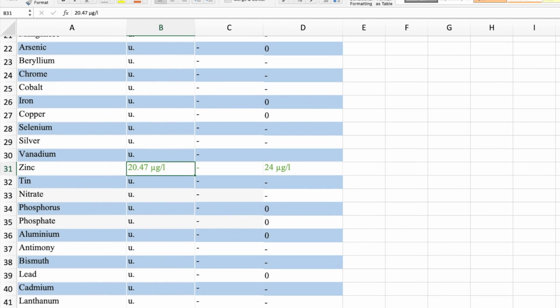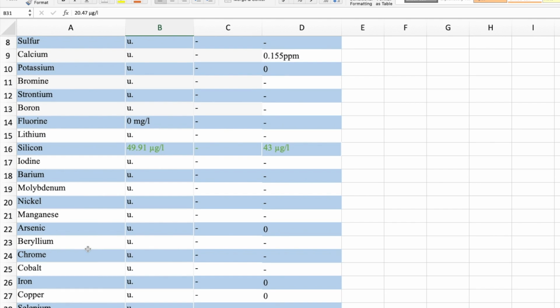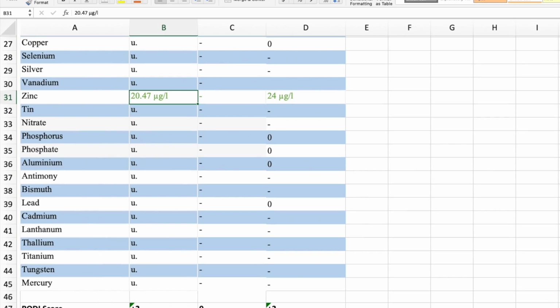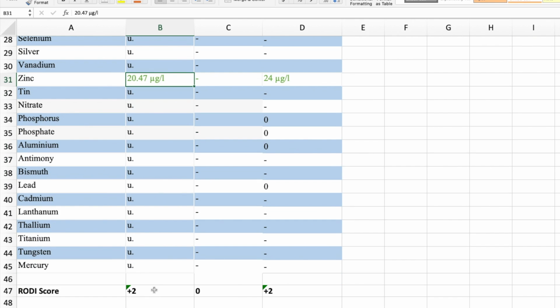For that reason alone, I've given them both an extra 2 points because it does tell me, and I know I've been getting a TDS creep in my RO lately, so I was expecting these results to find something, and they found a couple of things, so that's good. Both ATI and Quantum pick up 2 points each, which, if you're good at keeping score, does put Quantum a few points up.